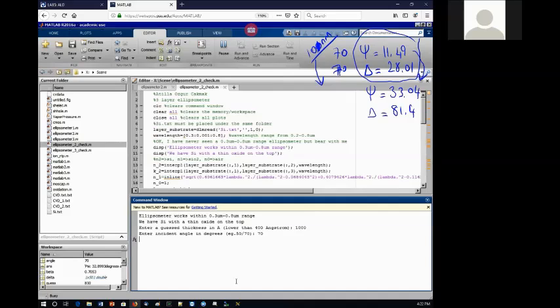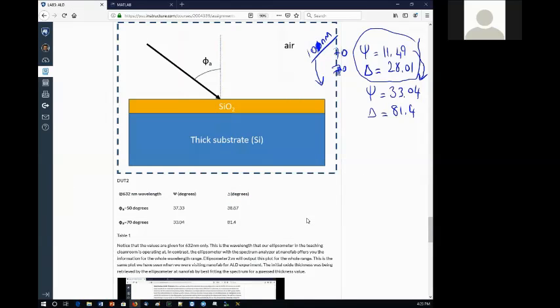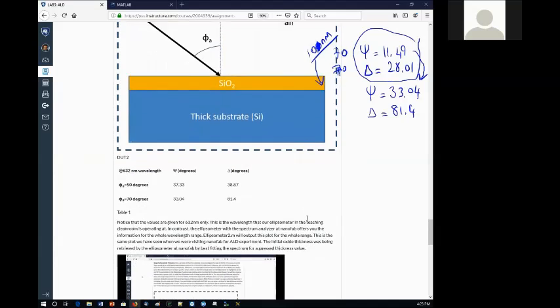That's why it's taking time. And pretty soon it will be done. The busy writing should go away. Okay, I'm very close. I think it's 810 or 814.